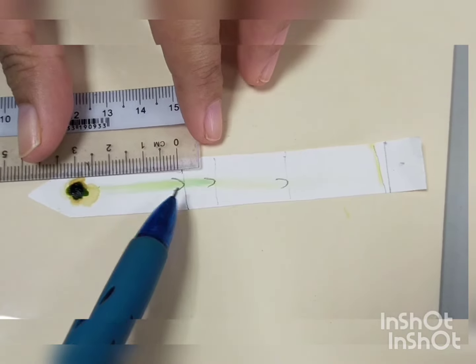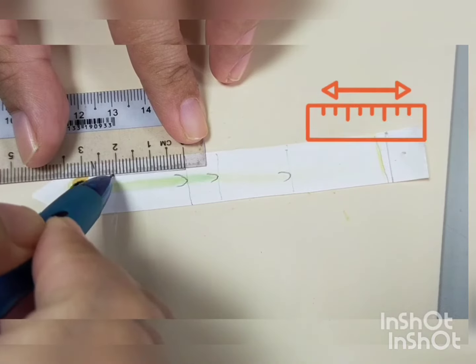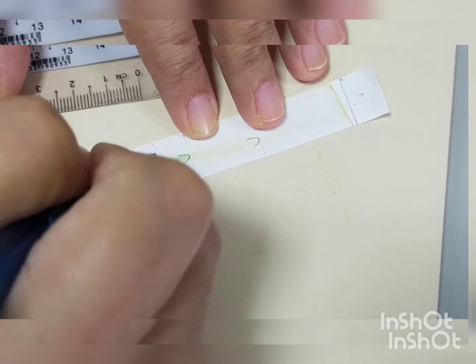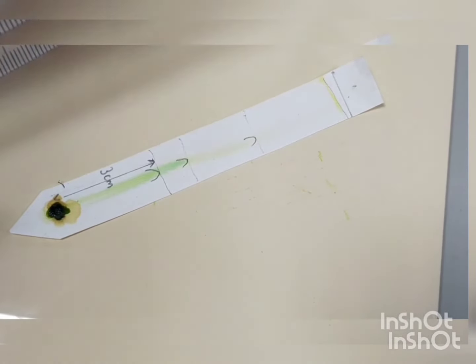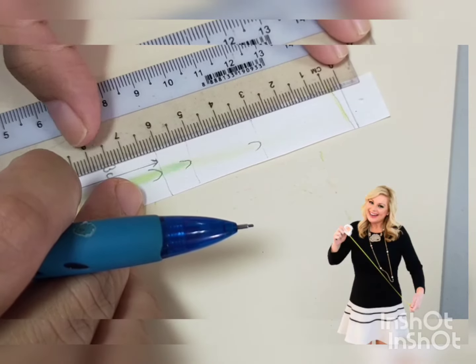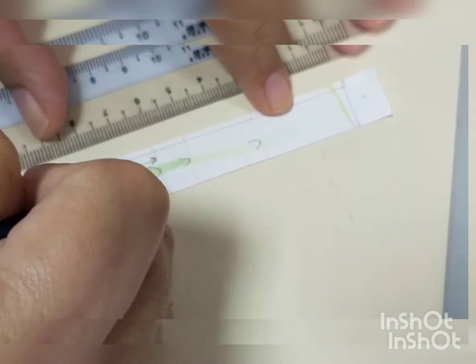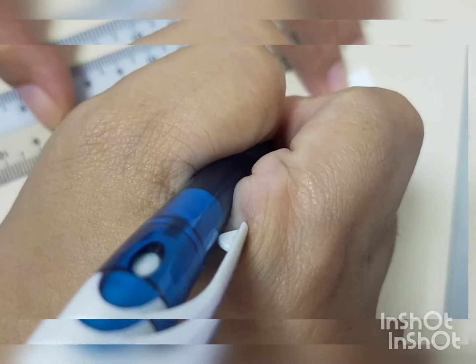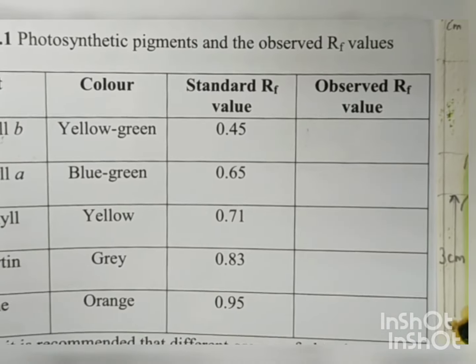First, measure the distance moved by the pigment from the origin. Label on the paper. Next, measure the distance moved by the solvent from the origin. And label. Finally, record your results in the table 11.1.